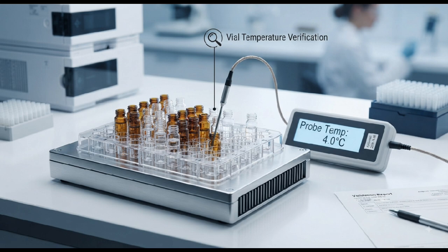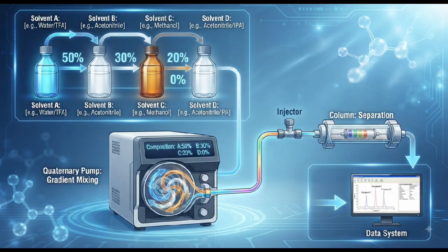Autosampler temperature. For systems equipped with temperature controlled sample compartments, autosampler temperature may also require verification. This is particularly important when the analytical procedure requires samples or standards to remain at a controlled temperature. The actual temperature is measured using a calibrated reference device and compared against the predefined requirements.